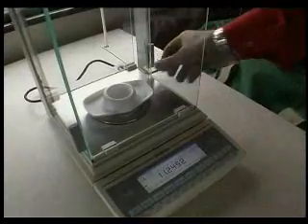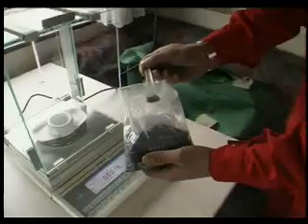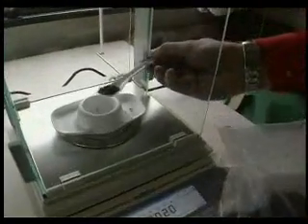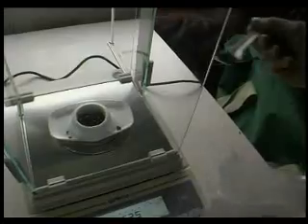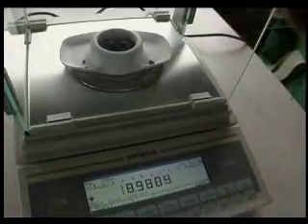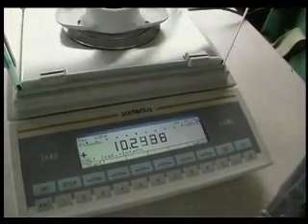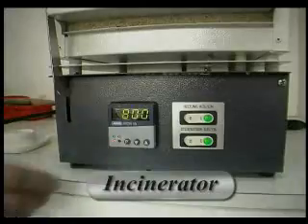The amount of reinforcement substance in re-grind or re-granulate can be determined through incinerating the material. For this test we require an exact weight — in our case, 10 grams. This is filled into a fireproof receptacle and put into a pre-couple.